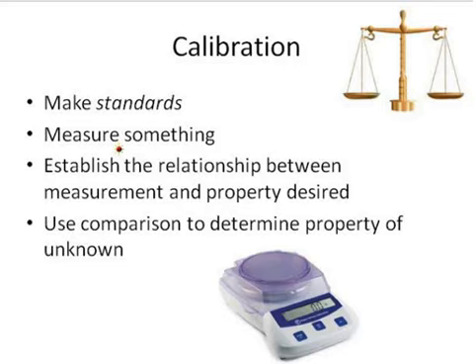So interestingly enough, the two things, the measurement and the known property, will be the same unit, grams per milliliter, mass per unit volume. But in one case, we'll determine the density based on a measurement of volume and mass, and in the other case, we'll know what the relationship is based on the amount of sugar, the mass of sugar that we place in a known volume of solution. So again, the same unit on both of them.